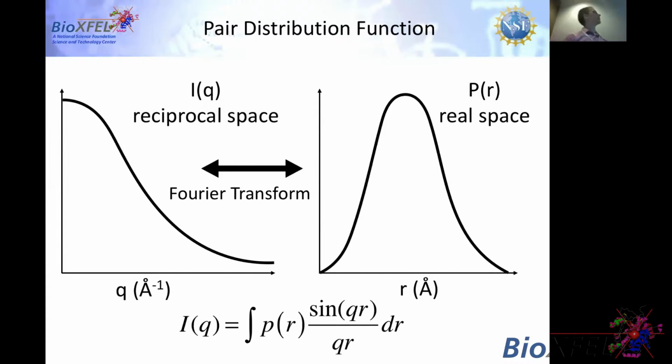Whereas in either crystallography or single particle imaging, you get a three-dimensional picture of the electron density function, in SAXS we don't get that. Not only do we lose phase information because of the inherent nature of detecting intensities and not phases, mathematically the spherical averaging wipes out any kind of phase information as well. Also, we only have a spherical average of intensity information.